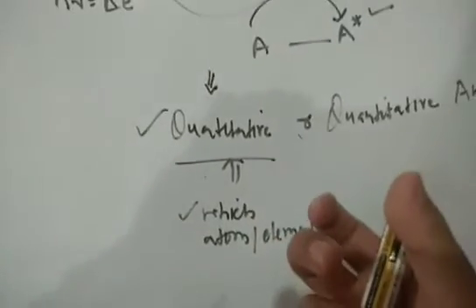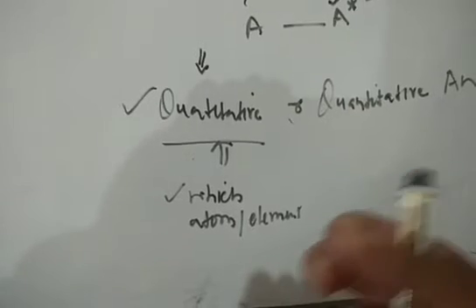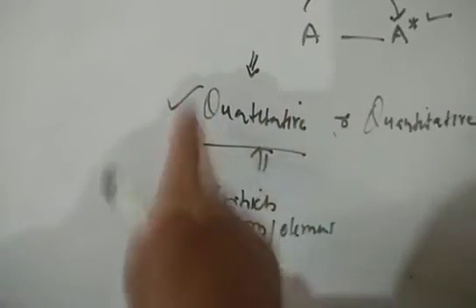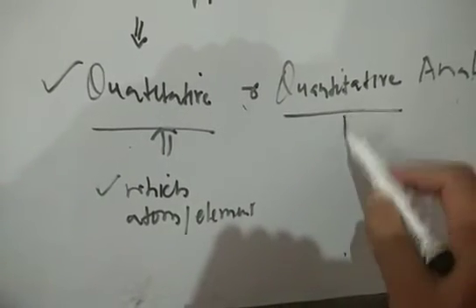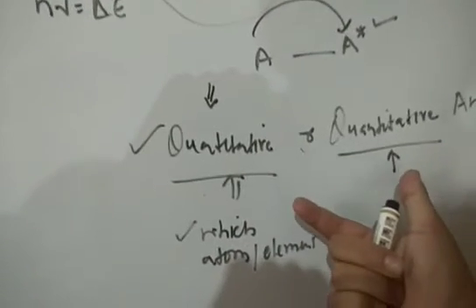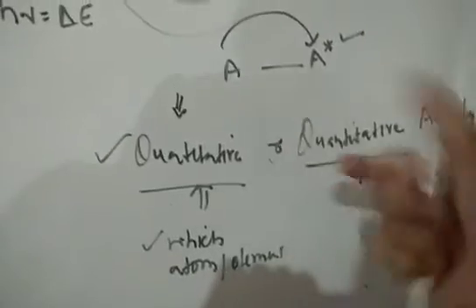हमारे पास अगर कोई सैंपल है, चाहे वो सॉइल सैंपल हो, चाहे एनी जियो सैंपल हो, एनवायरमेंटल सैंपल हो, वाटर सैंपल हो, तो उसमें कौन सा एलिमेंट प्रेजेंट है, उस एलिमेंट को डिटेक्ट करने के लिए ये जो प्रोसेस है इसको कहते हैं क्वालिटेटिव एनालिसिस। फिर उस एलिमेंट की कितनी कॉन्सेंट्रेशन प्रेजेंट है या एटम की, दैट्स कॉल्ड एज अ क्वांटिटेटिव एनालिसिस। सो इन जनरल बाय द एटॉमिक एब्जॉर्प्शन स्पेक्ट्रोस्कोपी वी कैन एक्चुअली अचीव द क्वालिटेटिव and quantitative analysis. That means we can determine the type of element present in the sample and also its concentration.